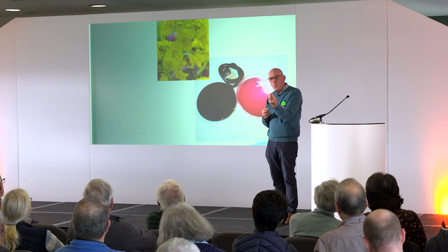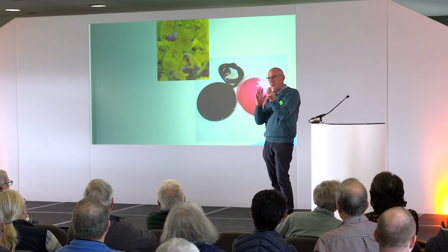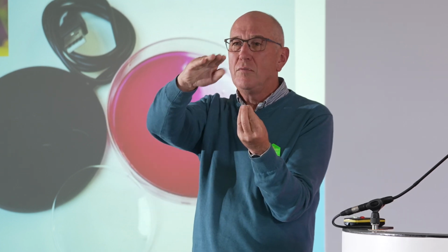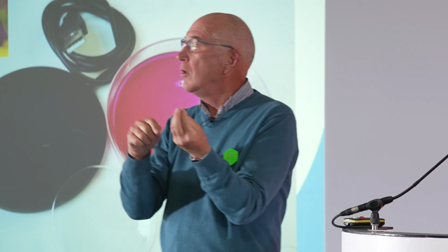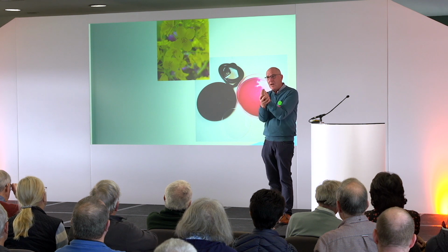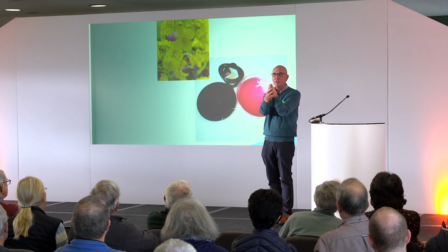When you want to find out, what I do is go around my garden and the surrounding area, and at set times throughout the season, I find a flower, I cut the flower, and I store the anthers and the pollen. I know which tree it is, so I've marked it down that it's a sycamore, or a field maple, or a hawthorn, or whatever. So I now know what tree that pollen came from because I got the anthers.